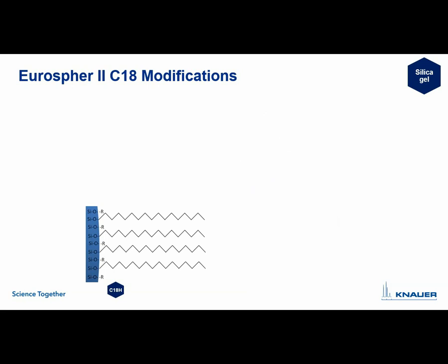Now, for the C18H phase, it's the other way around. You can use really unpolar analytes. We analyzed DNOP, for example, and here you see it has a lot of places where it's not so polar, and this works fine. Another advantage of this column is that it has an extended pH stability, because no mobile phase really gets on the particle. Everything is covered here. So this one is much more stable in high or low pHs than the classical C18 phase.